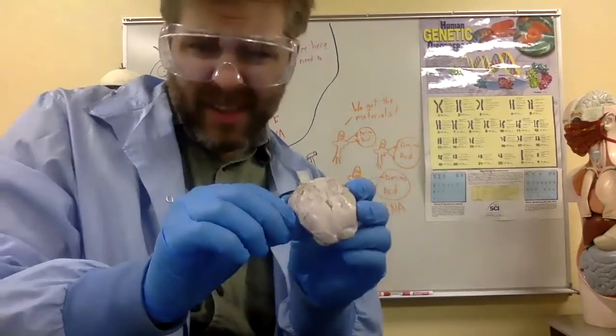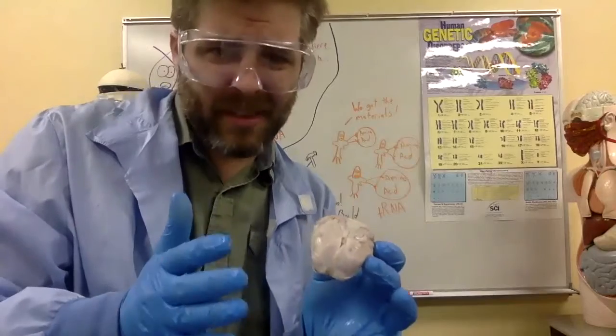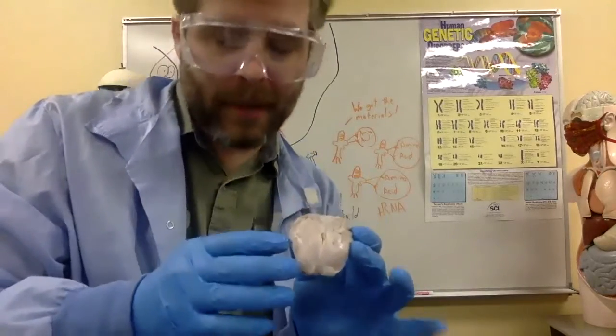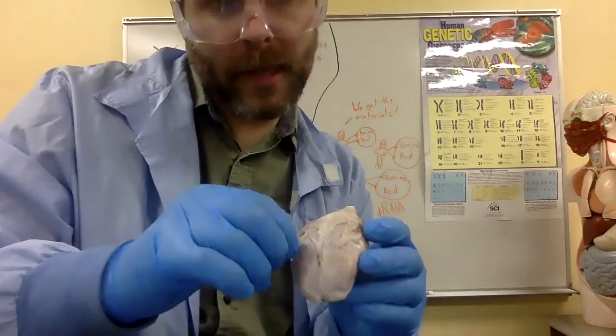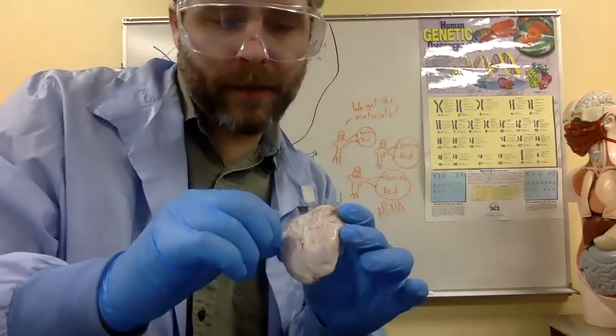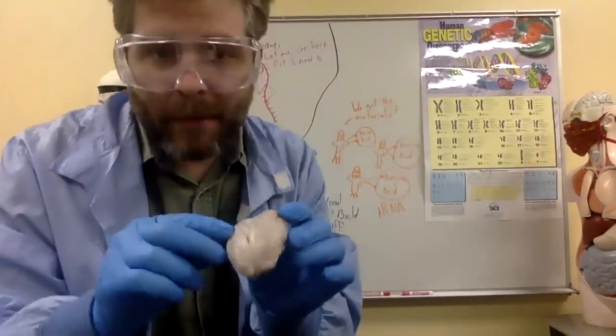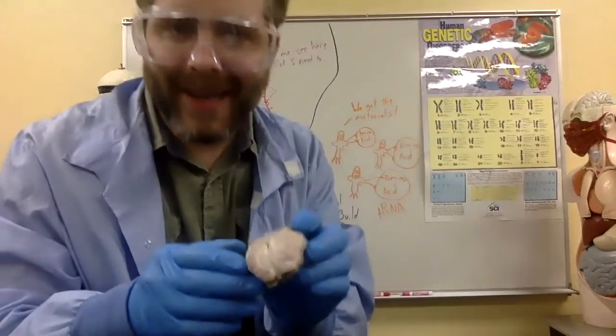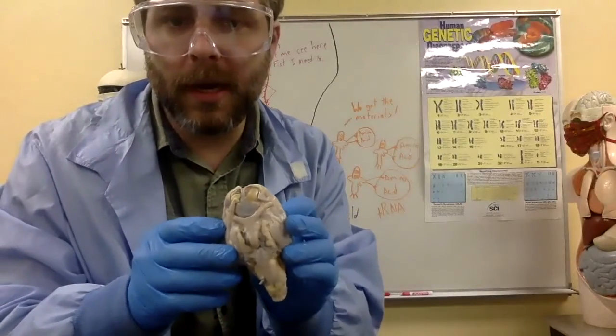It's actually 3 layers of covering because your brain's that important. It needs 3 layers. Those 3 layers are called the dura mater, the arachnoid mater, and the pia mater. What you're looking at is the dura mater, the thick stuff on the surface. And yes, I am going to remove this when we actually get into the dissecting part of it, but not yet because I want you to see underneath.